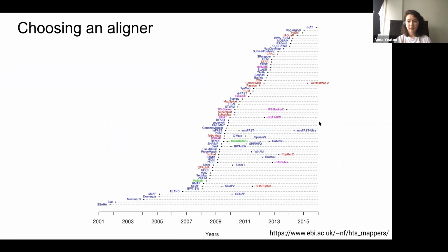Does each user have to download a standard reference to Big Purple, or is there a shared directory / path? I'm not sure if there's a shared directory for everyone. We're gonna download standard references to our own folders as part of the class. So the genomes for Ensemble and UCSC should be the same.